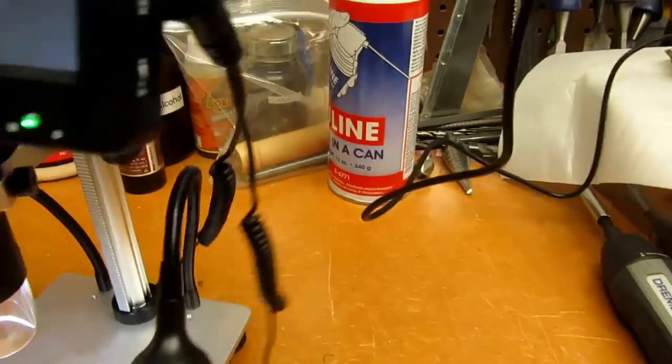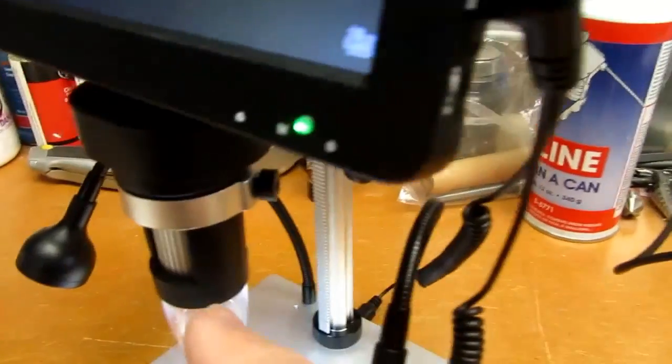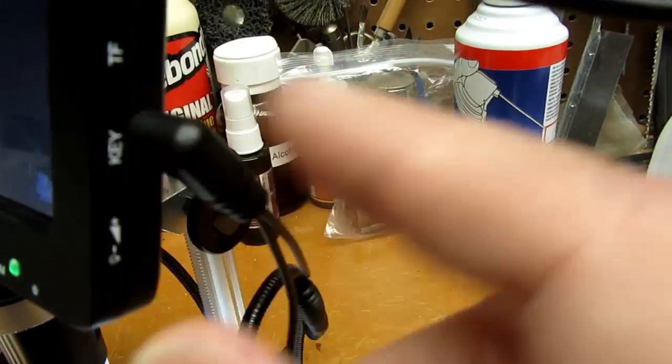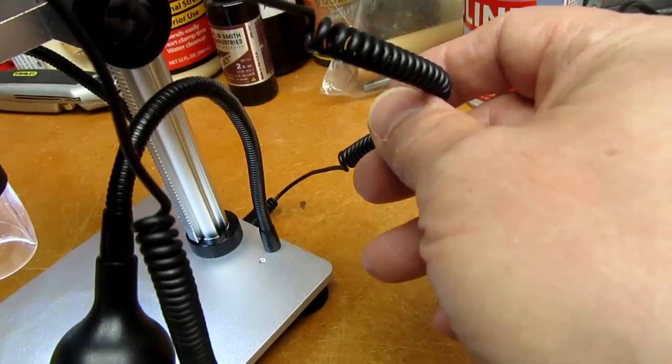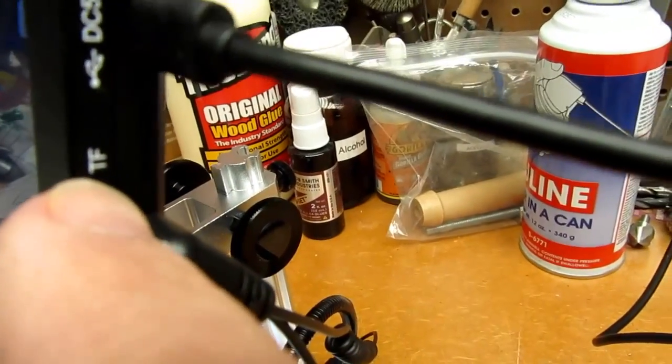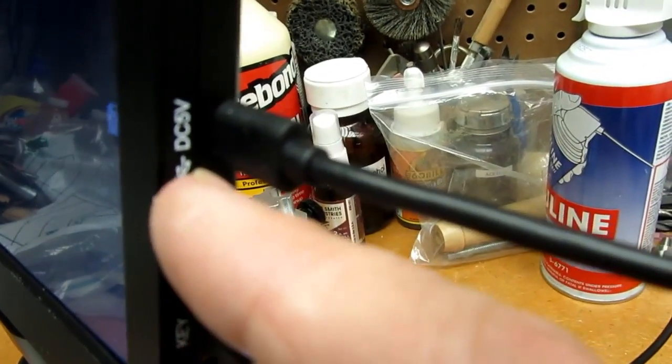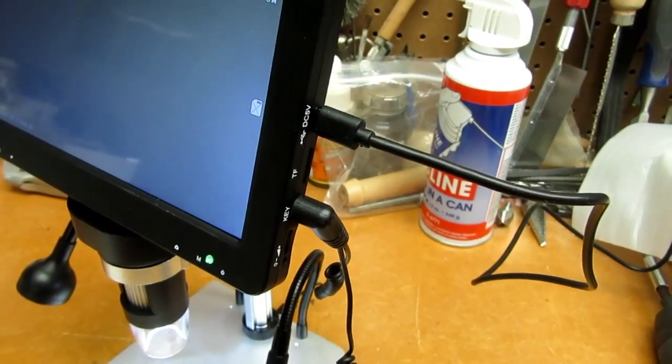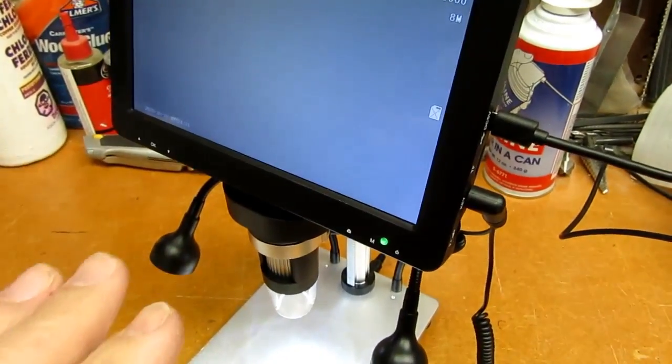So going around the right side, there is another little thumb wheel here to change the intensity of these lights. There is also the plug that goes to this dual forked cable, one of which is the one that supplies power to the base for those lamps and the other one which goes to the wired remote control. Then there is a thing they call TF but that's really for a micro SD card, and then finally another USB port which is to either power the whole microscope or to charge its battery or both.